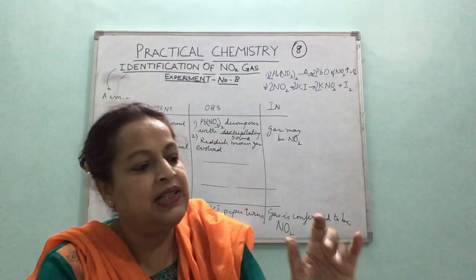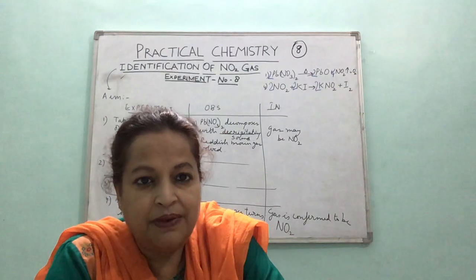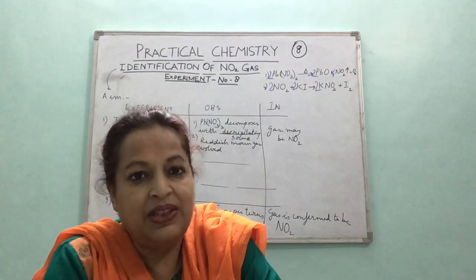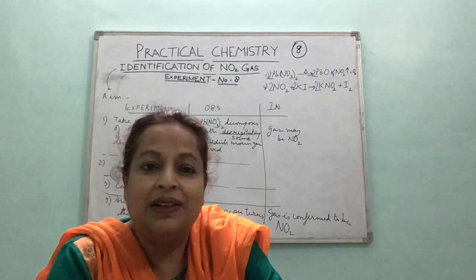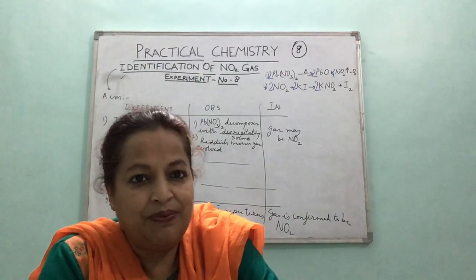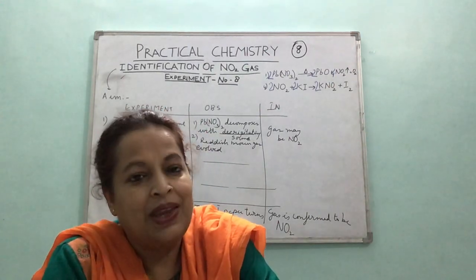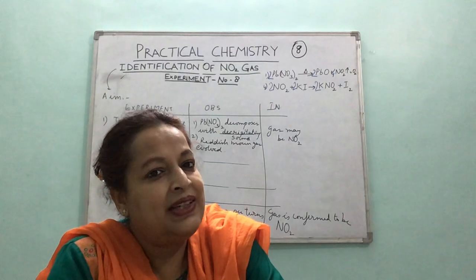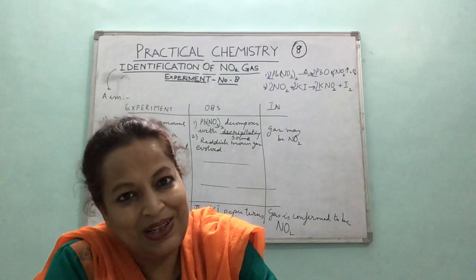The H2S gas, which I have not done till now, the reason being I don't have a certain chemical which is needed to show that test. So that is why I have taken NO2 gas today. And in one of my videos I'll be showing H2S, hydrogen sulfide gas, also. All these gases including H2S are the acidic gases which are in your syllabus.